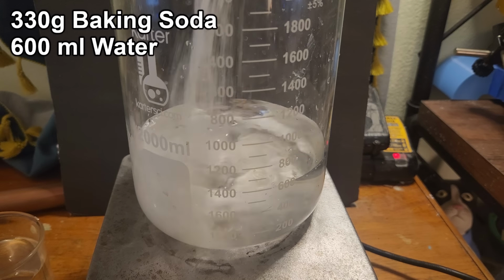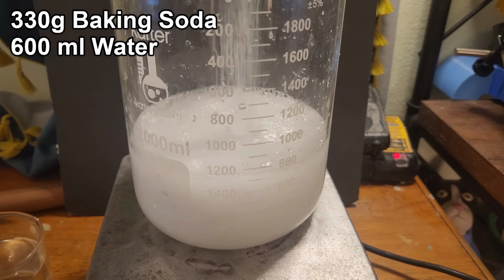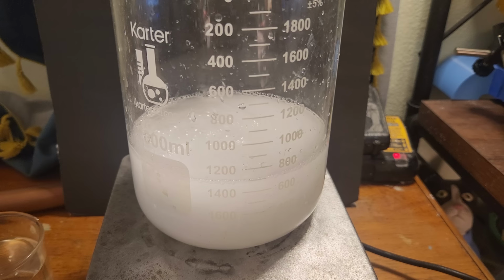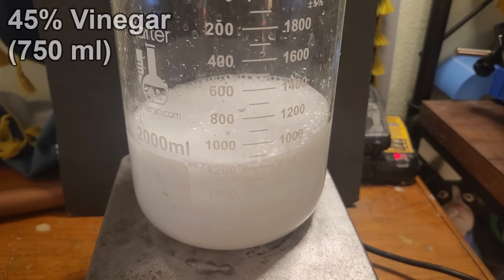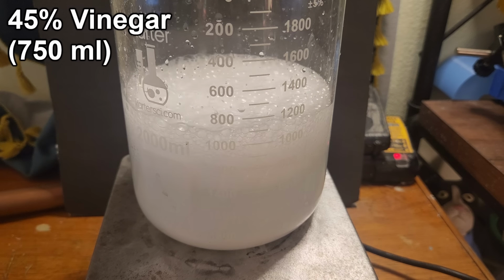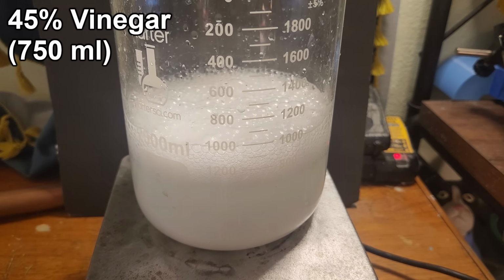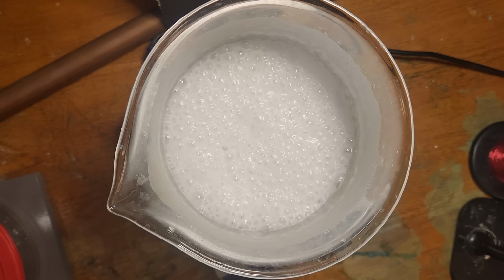I'll mix up 330 grams of baking soda and 600 milliliters of water. That's not enough to dissolve it all, but as long as it's getting mixed around, it should react when I pour in the vinegar. Then I add 750 milliliters of 45% vinegar. I only add a tiny bit at a time, otherwise the foaming from the CO2 that's produced will cause the solution to overflow. You can use sodium hydroxide instead of baking soda to avoid the foaming since that reaction doesn't produce gases, but I really hate working with it because it's so caustic.